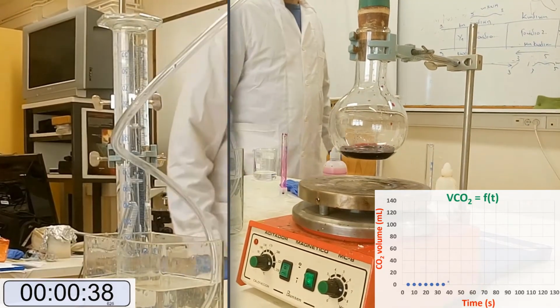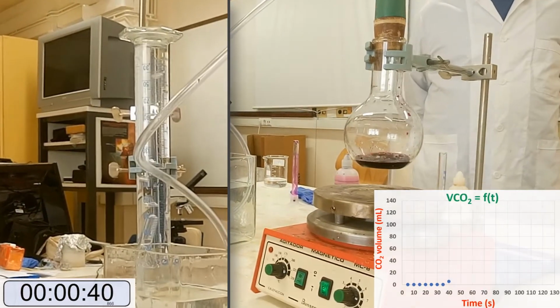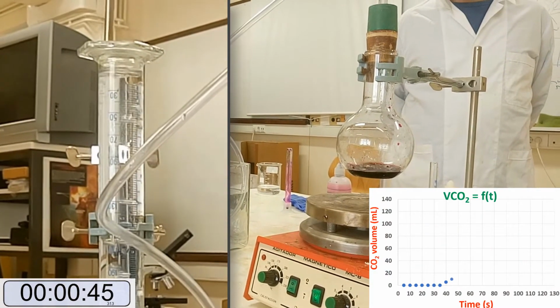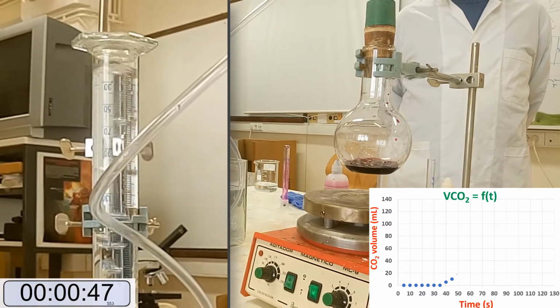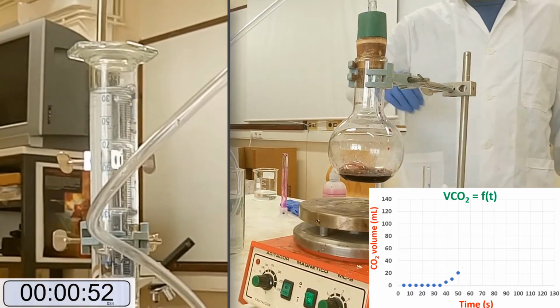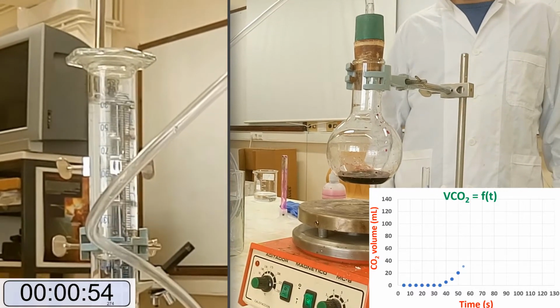Production of small amounts of manganese 2 catalyst speeds up the reaction, and CO2 bubbles appear in the cylinder, with a progressively increasing rate.